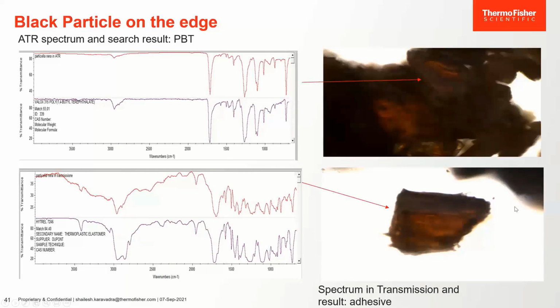There are two modes of operations for particle analysis. One is a manual selection of particles, or automated with reference to the position and size of the particles. The particle wizard automatically allows the analysis of the region. After the region, the video image is selected, the software identifies the target particles and proceeds to produce spectra for each particle. So this is a typical process.